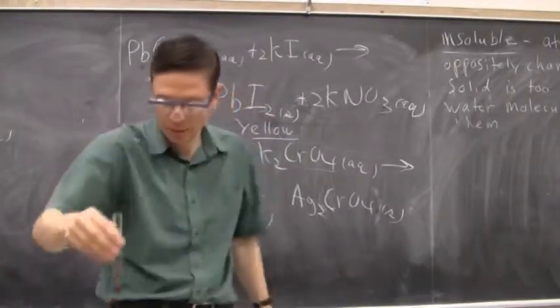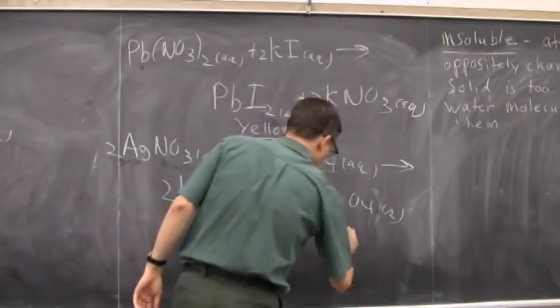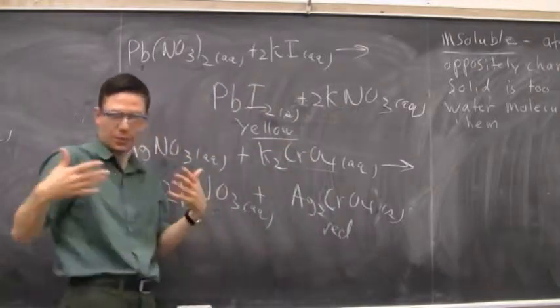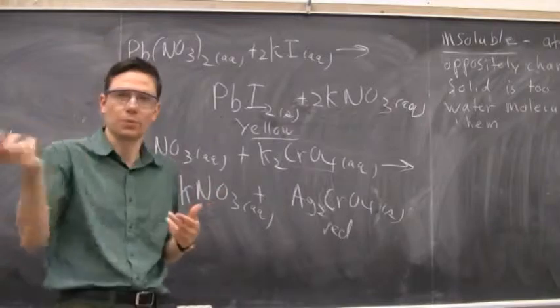Now I'll let these sit here in the beaker, and eventually they'll separate out at some point. The best way to really separate out the precipitate from the solution itself, or the solvent, would be to use a centrifuge, which we'll be using next time.